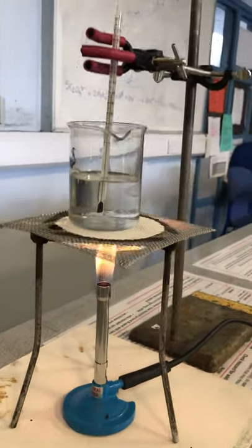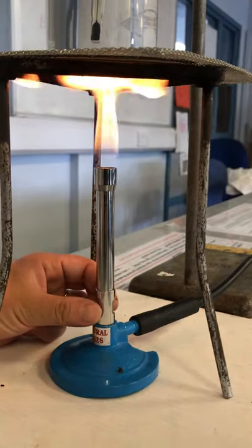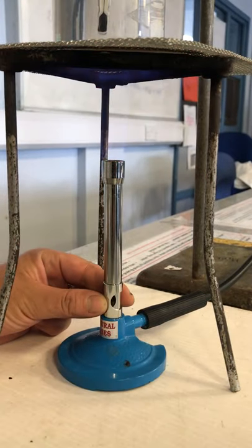Once you see the orange flame, which is also a safety flame, open the air hole of the Bunsen burner halfway by rotating the metal collar.